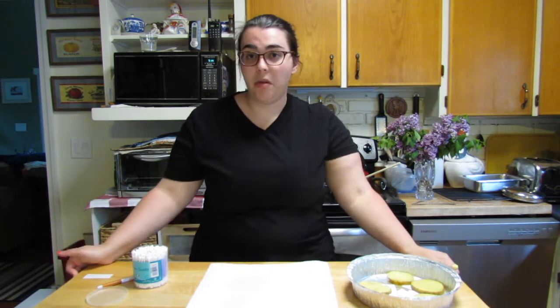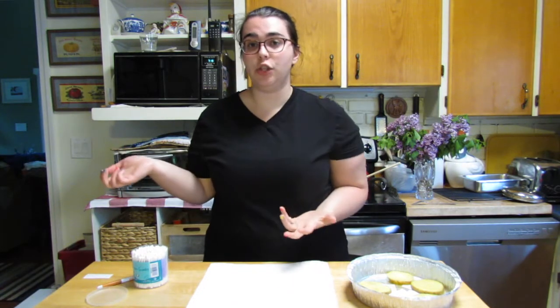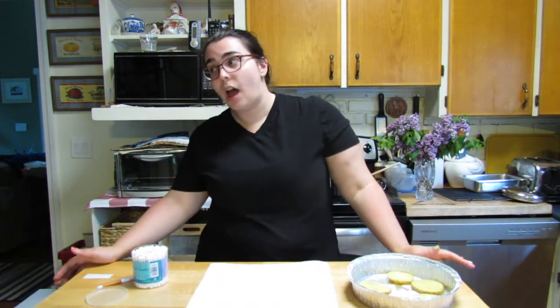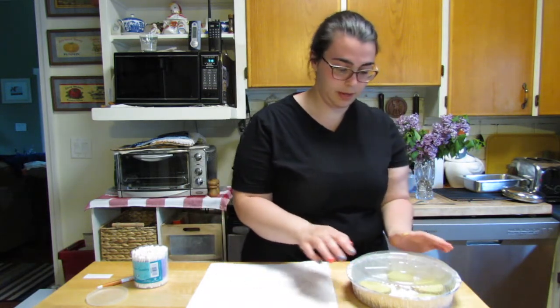Now that we've got bacteria samples on all of these potato slices, we need to incubate them. In school we would incubate them in our incubator — it's a sort of warm little box, like a warm fridge, that lets bacteria grow. A lot of bacteria like to grow in warmer temperatures, like the temperature of our body. But these are going to incubate at room temperature, so let's see which bacteria will grow. I'm going to cover them with a lid and leave them at room temperature overnight.